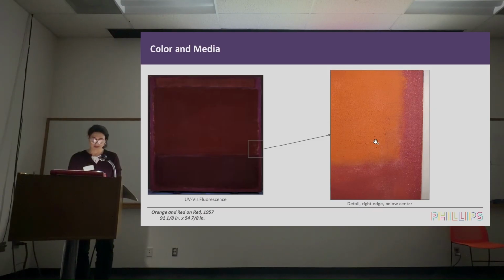In particular, there seems to be a colorless layer. There's an area here that's relatively glossy on the very matte orange surface that in the UV fluorescence image, you can see a little dot of fluorescence in that space. And that same color of fluorescence can also be seen along the edges, along with other colors of visible fluorescence.